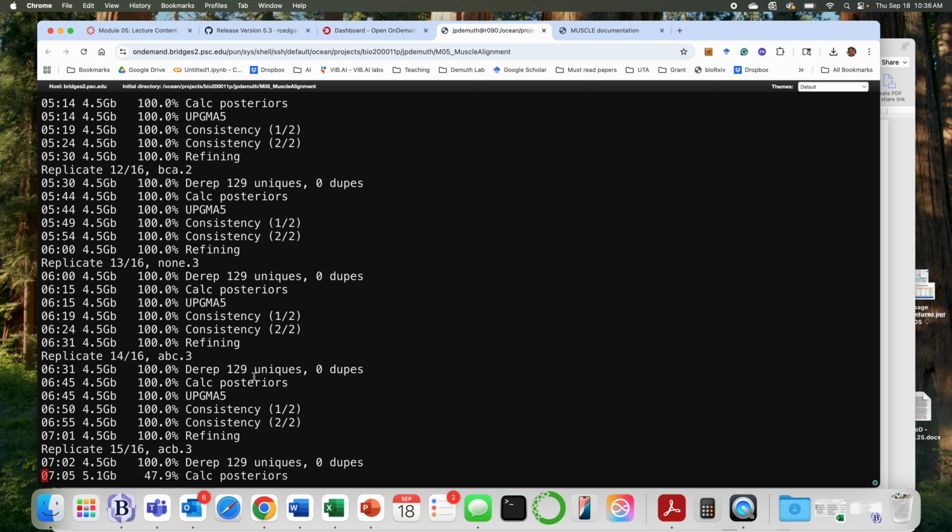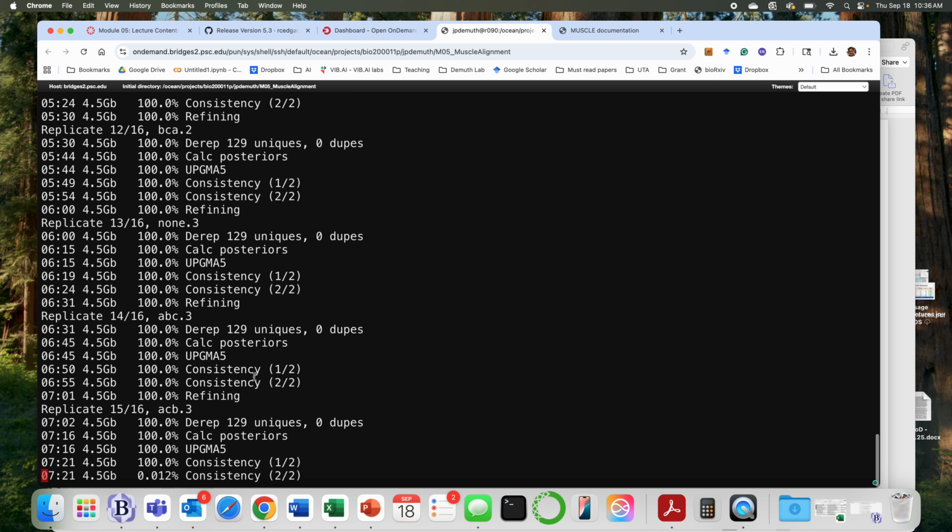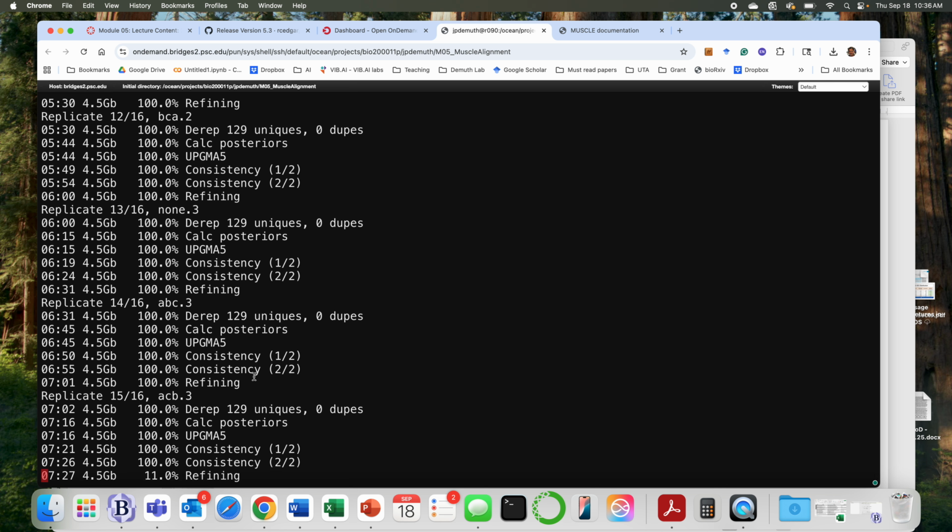No, that's going to work now, except for the same thing I did by accident with threads, or thread dash thread. It doesn't really matter where you put it, but just put it at the end. So it'll be whatever your output was. And do I need to do that every time? So from your last run, when you aligned it, this was your output.